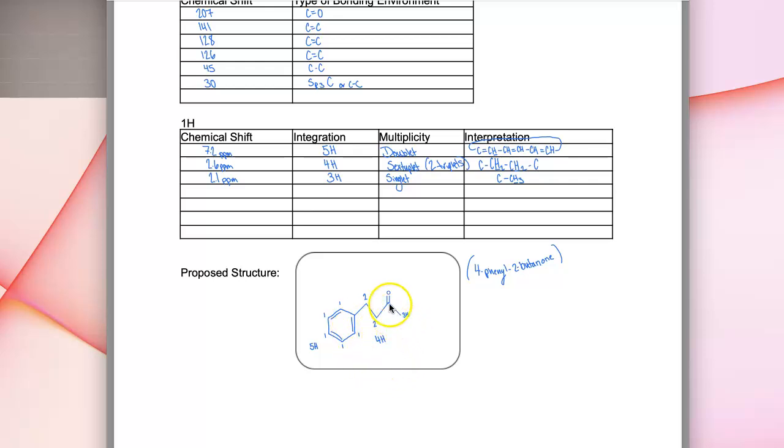And then off of our 3 H's here, off of our carbon with our ketone here, we are able to see that it does not see any other carbons, so it is a singlet, which leads us to our compound, which is our phenyl here. So off of 1, 2, 3, 4, our phenyl connects to the 4th one. And so that's 4-phenyl. And then our ketone here is on there too. So 4-phenyl-2-butanone is our compound.